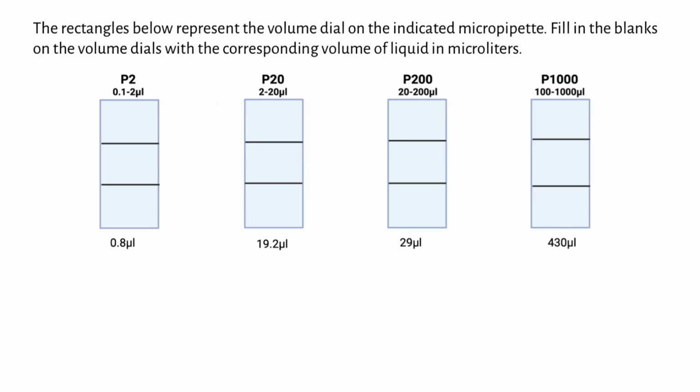Welcome to Nikolay's genetics lessons, and today we are going to talk about laboratory techniques, and specifically we are going to talk about how to dial the correct number on your micropipette.